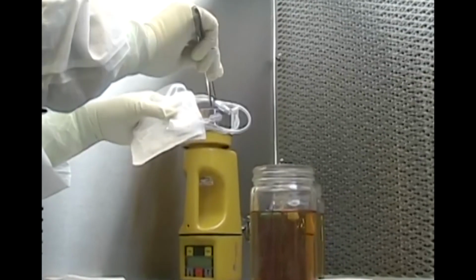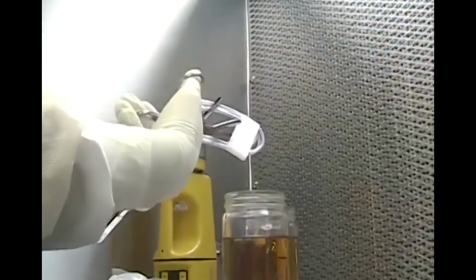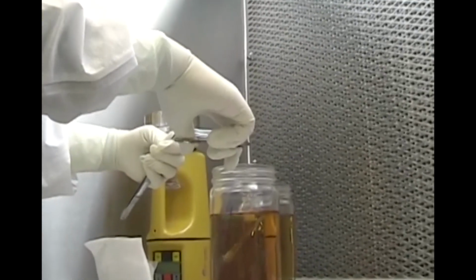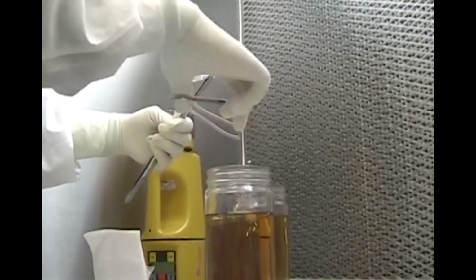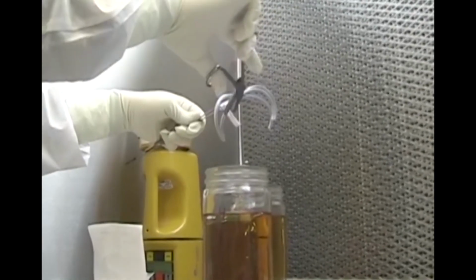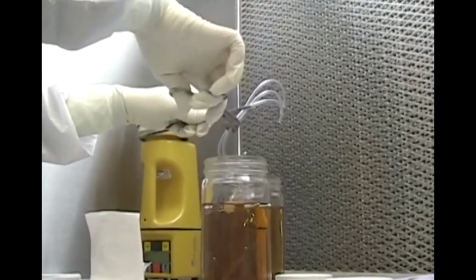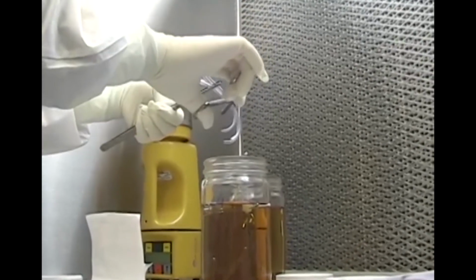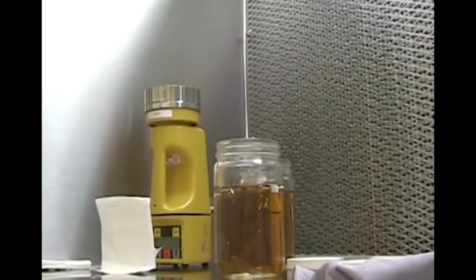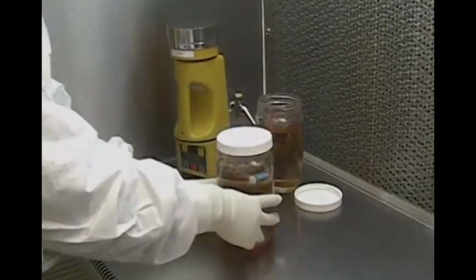The samples are aseptically transferred to the appropriate volume of test media. The sample is fully immersed and then incubated for a minimum of 14 days.